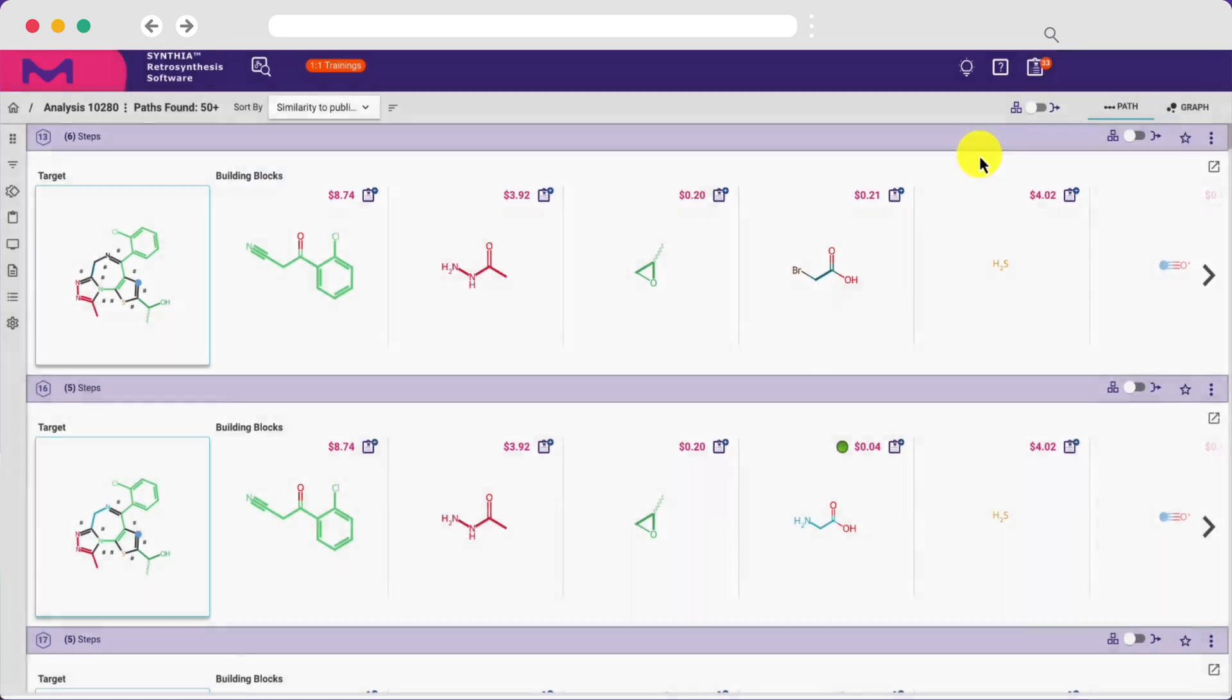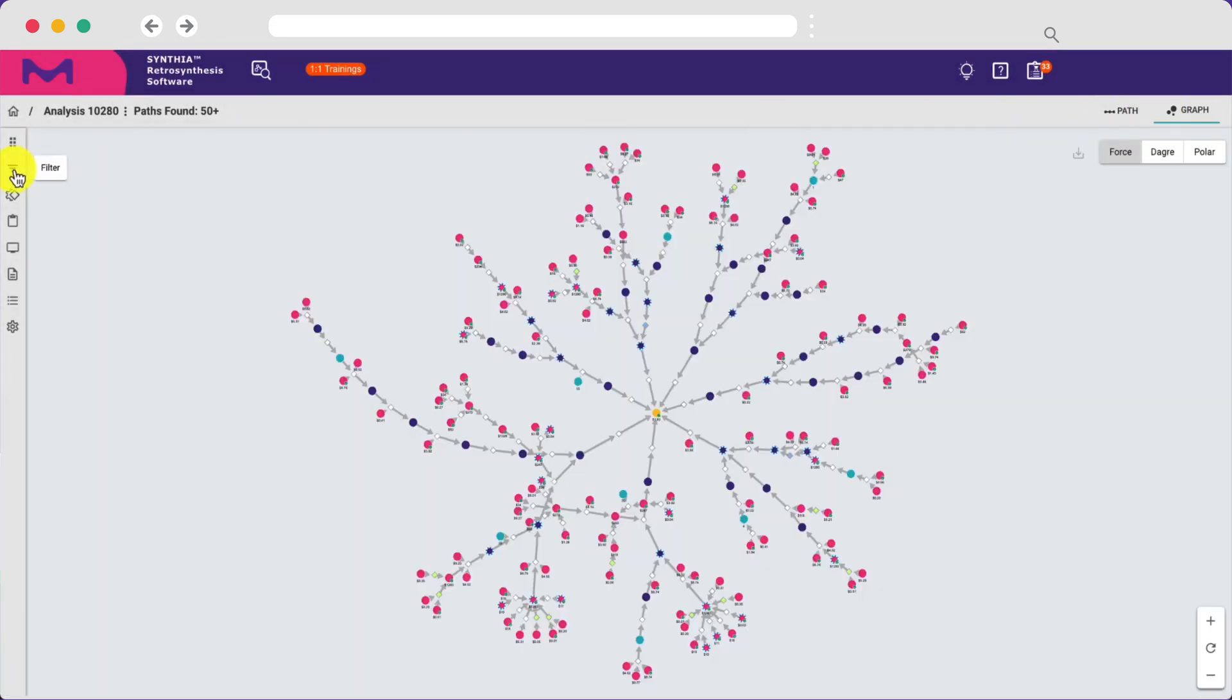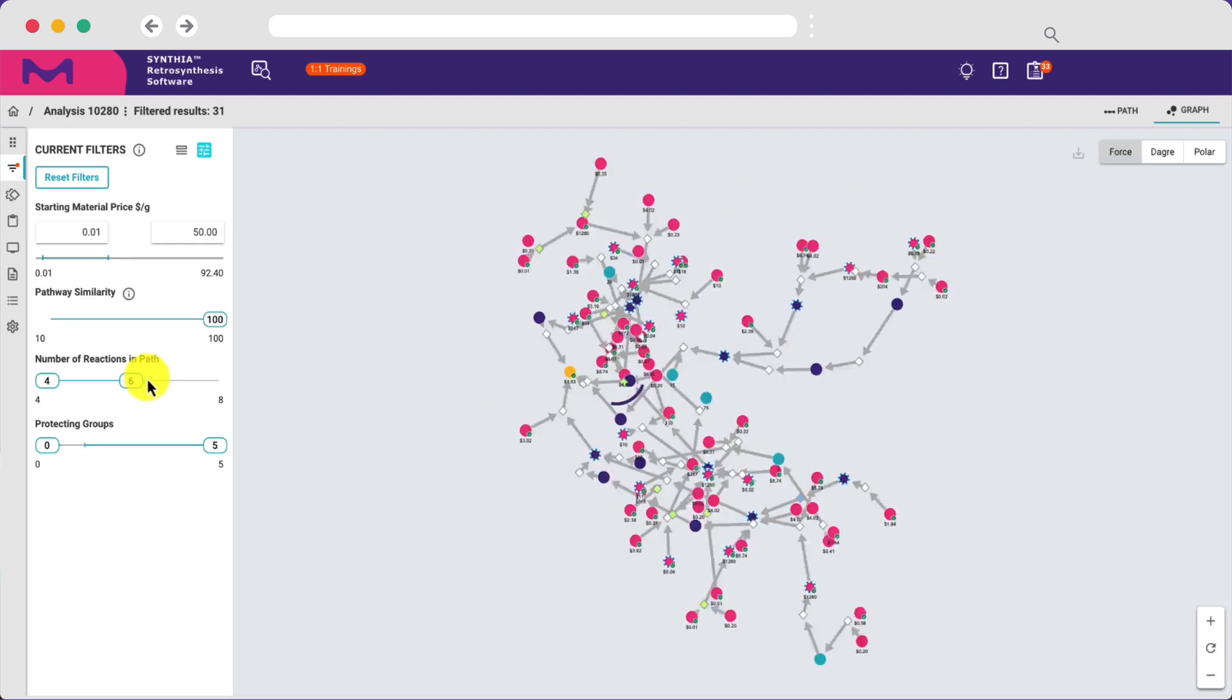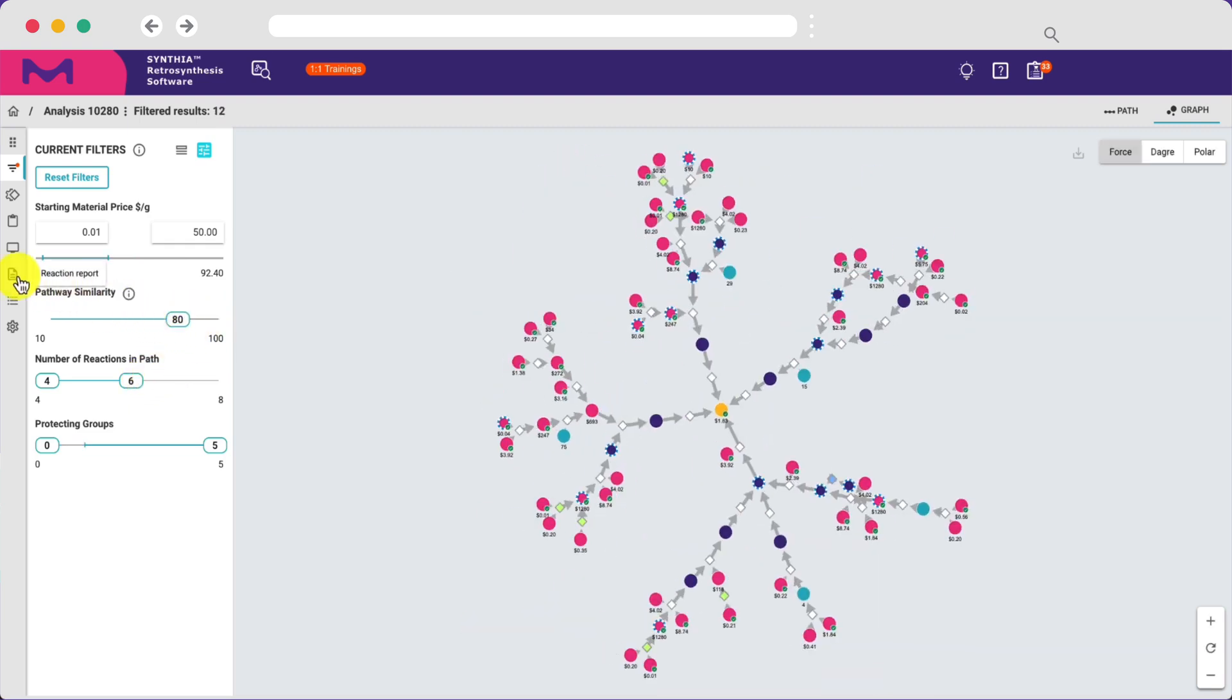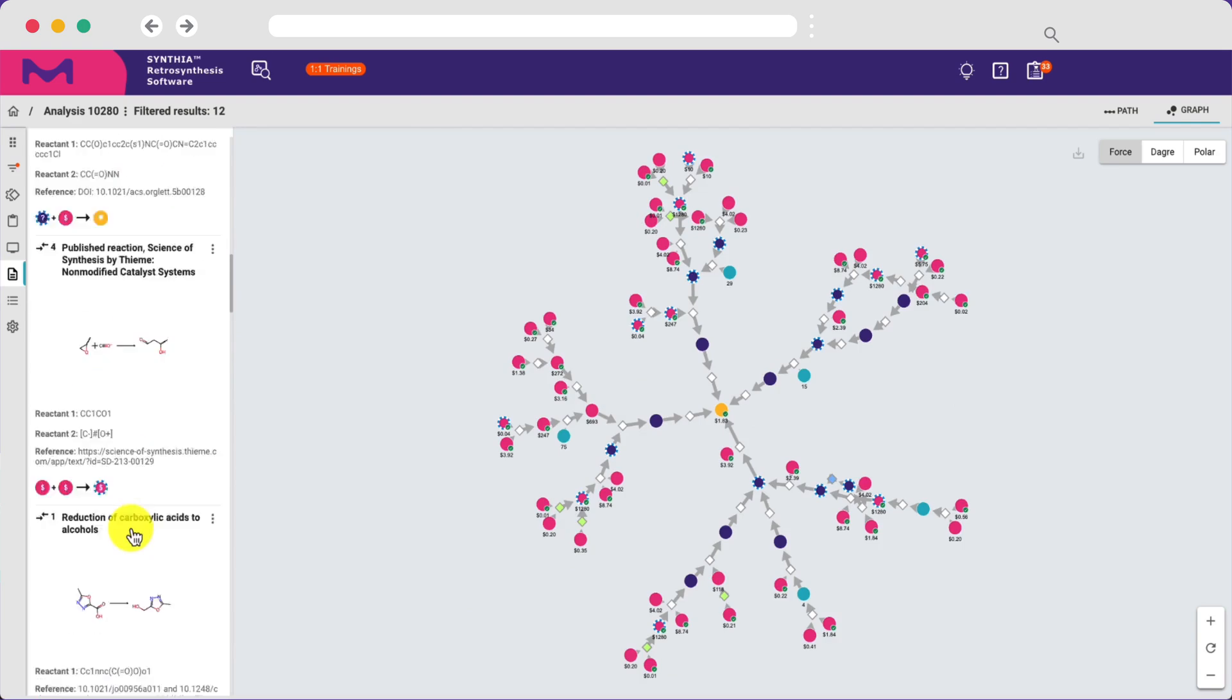You can also view the entire graph of results to see which starting materials, intermediates, and reactions are repeated across pathways, and apply filters to simplify your graph based on the cost of starting materials, pathway length, overall similarity, or to remove specific reactions or molecules.